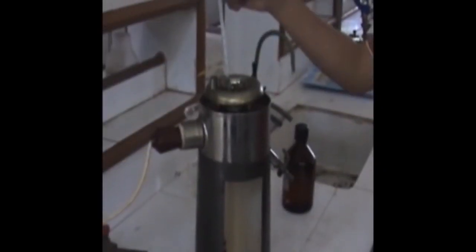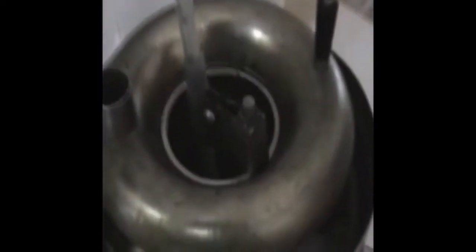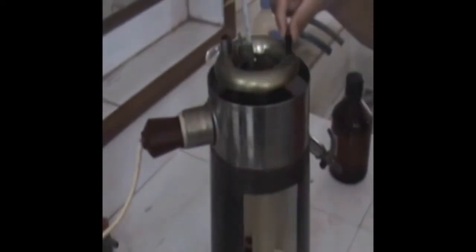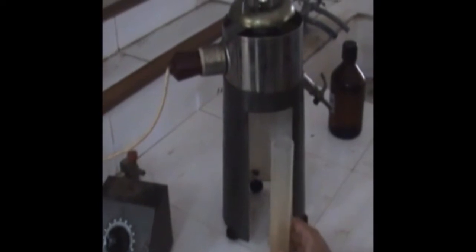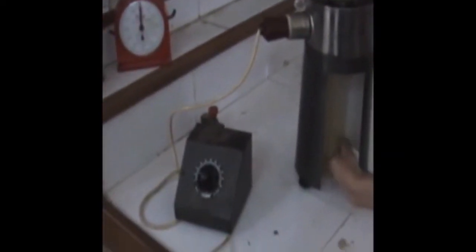Moving on to the other viscometer, the Redwood viscometer 1. As you will see, the apparatus is quite similar to Redwood 2. But you'll notice that the orifice in this viscometer is smaller than Redwood viscometer 2. This enables it to take more accurate readings of lubricants having lesser viscosity. Moving on, you will see the same measuring cylinder and the temperature regulator as in the Redwood 2.